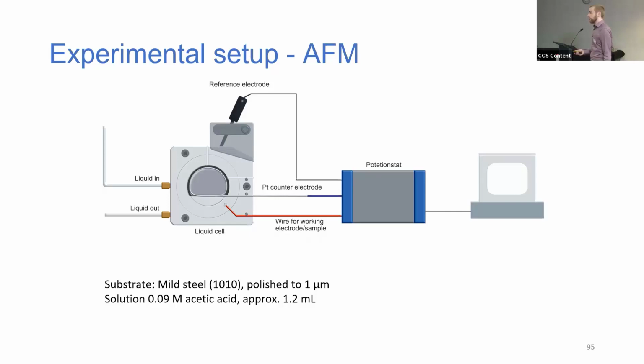On the back of the cell, there is a spring-loaded gold contact which pushes into the sample. This allows it to be used as a working electrode, and a platinum counter electrode is coiled around the inside of the cell. There is a slot at the top for a dry ref micro reference electrode, so we can do three electrode setup experiments with this.